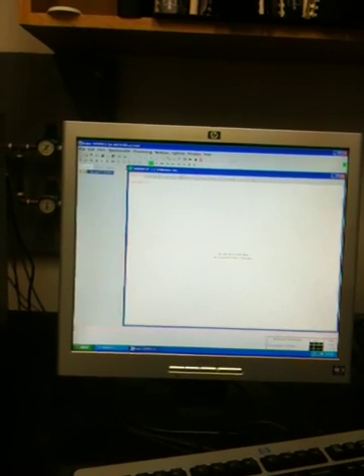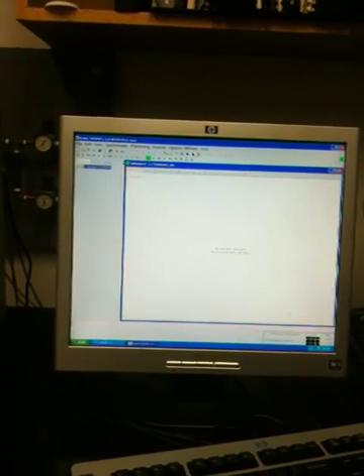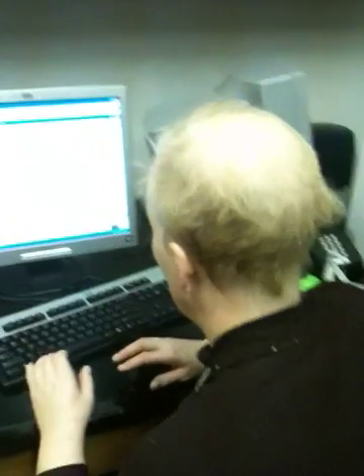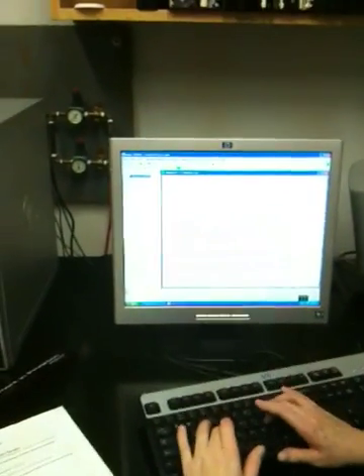The next thing you have to do is lock. Now, locking is the thing that students have a very hard time understanding, and this probably won't make a lot of sense to you until we've gone over some NMR theory in class. So don't get too upset if this doesn't make sense.